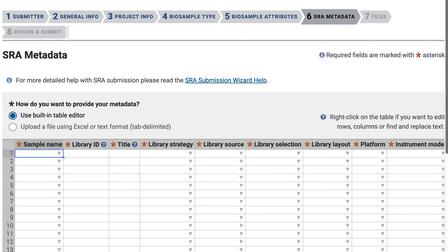I'm going to choose the built-in table editor, but similar to biosample attributes, you could download the metadata template, fill it out, and then upload it here. I'll fill in only the required fields, starting with sample name. These names should match those in biosample attributes, and you can use the pull-down menu to fill in these name fields.